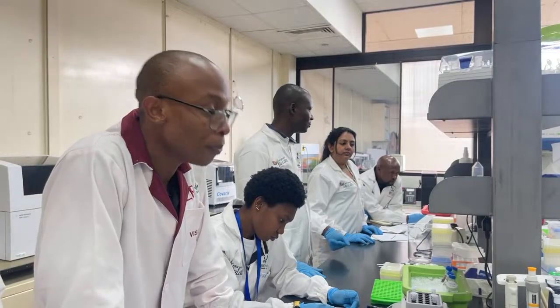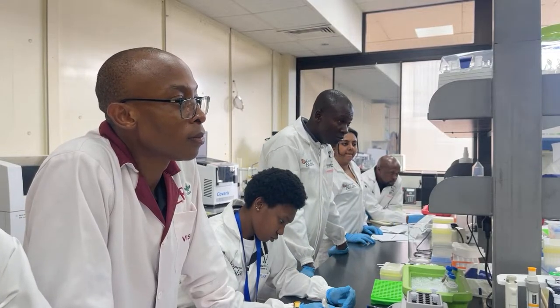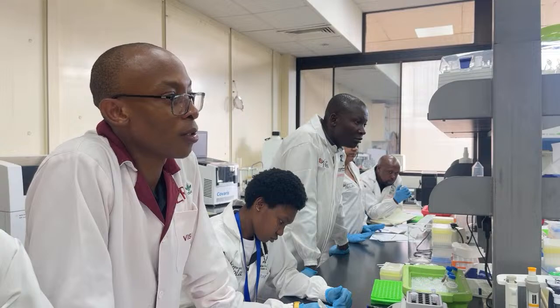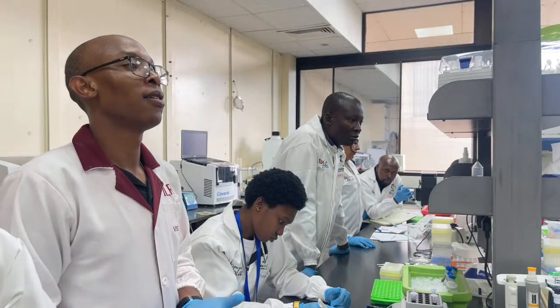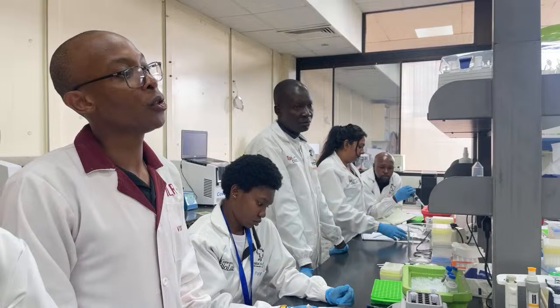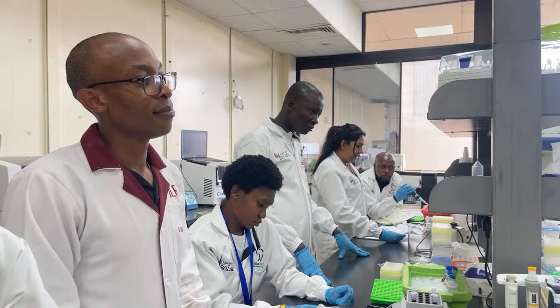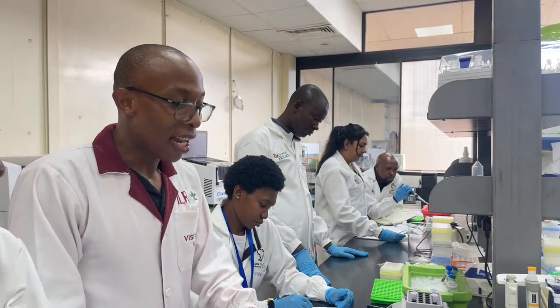Why I'm asking is because of these plant tissues that we sometimes extract DNA from, there's a variation. I've worked with plants, but sometimes you find that a protocol works for one plant, and then with the same protocol you move to the next plant and it doesn't work. The same applies to kits. Yes. I think Dennis sold some kits back then, and we tried extracting DNA from a marine ecosystem, and it became very difficult to get quality DNA. But when you supply that with the Zymo kit, now it works. You're right. So when designing this kit, do you consider that there is no universal way of extracting DNA from a tissue? Designing is way over my head.